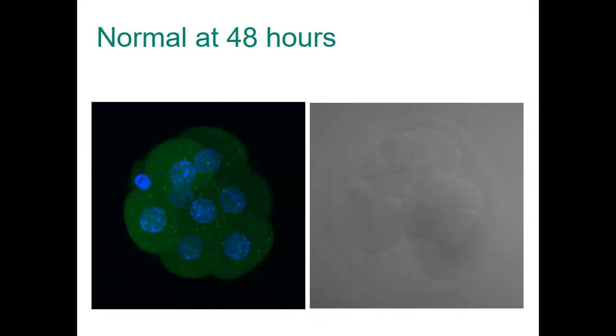Here is the picture at 48 hours. At 48 hours, mouse embryos are normally at the cleavage stage. Under the fluorescent scope, if it's a normal one, the blastomeres will show green fluorescence. And as I mentioned, the blue color indicates the nucleus of each blastomere.